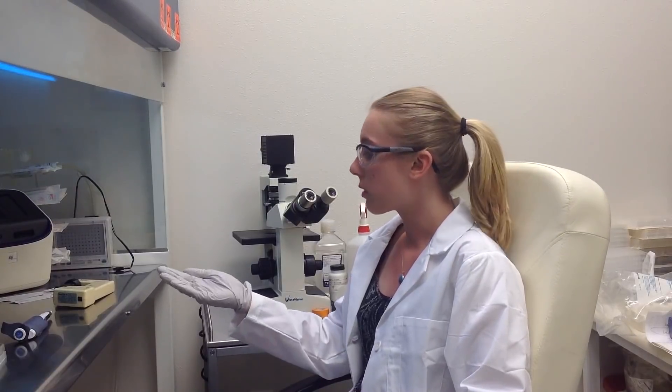Today we will be transfecting HEPG2 cells obtained from ATCC. We will be using a transfection kit manufactured by Altagen Biosystems.